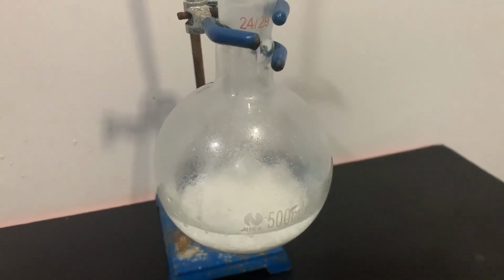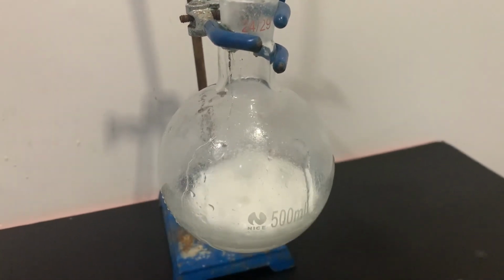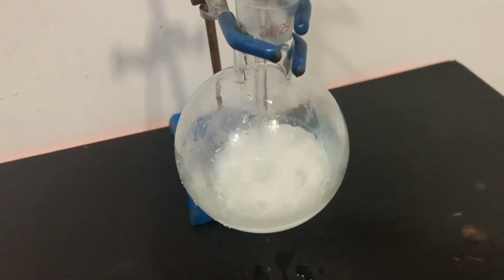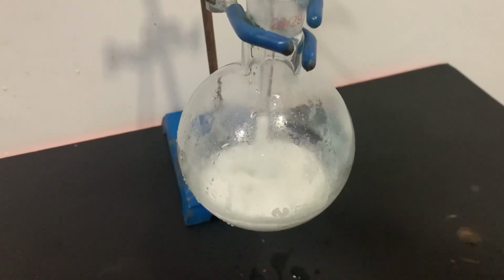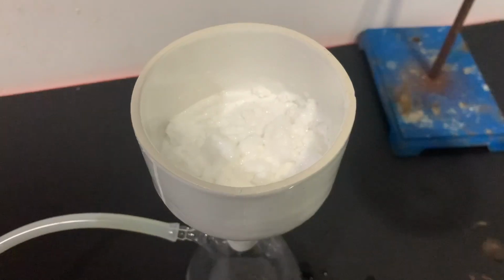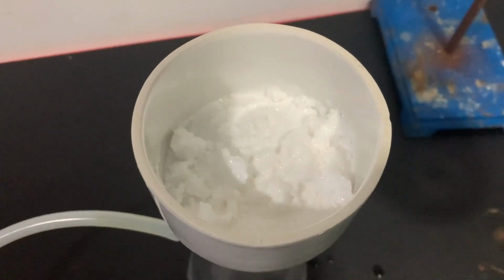When this happens, I let it cool down and then add in 100 milliliters of water. The phthalimide formed as a single solid chunk, so I broke it up with a glass rod. After breaking it into smaller pieces, I did a vacuum filtration.